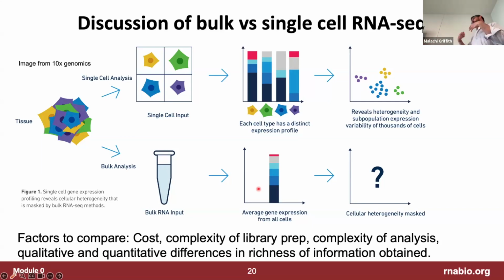And the data was already really expensive to produce, which is another difference between bulk and single cell. And unfortunately, even if you have a lot of money, you can sequence more, but at some point the library becomes saturated, and even at saturation for most single cell RNA-seq libraries, it's still relatively sparse. You can produce 1 billion reads or even 2 billion reads for a single cell experiment, which will cost you quite a bit, and you still have pretty sparse counts of most genes except for the more abundant ones.